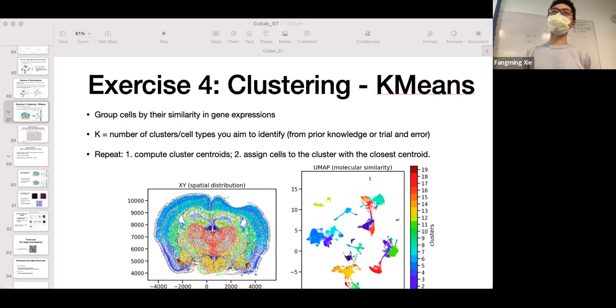After you group by them, you take some operation. The operation we want to take is mean. Take the mean across everything. Then the results will be the centroids. What does it mean? Let me show you. And it's actually really fast. Here, because I defined the 10 different clusters, each row is one cluster and each column is one gene. So it's 10 clusters by 483 genes. And the number shows the mean expression level of all cells for every gene. So that's our centroid matrix.